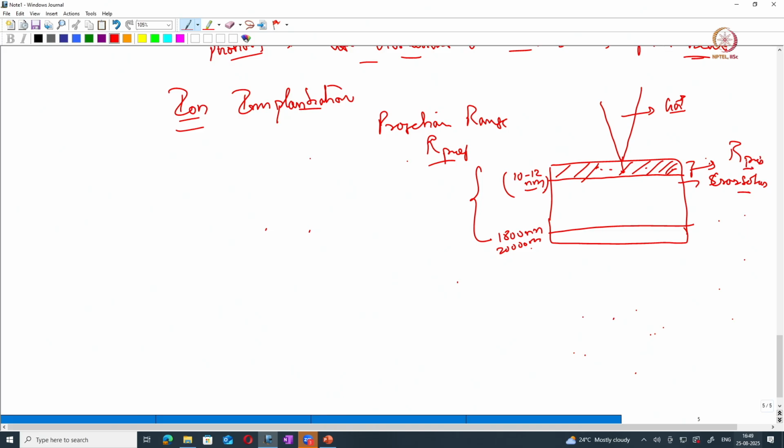In the case of gallium, when it gets implanted into the sample surface, it can change the physical properties of the sample in that layer, which may be the crystal structure.